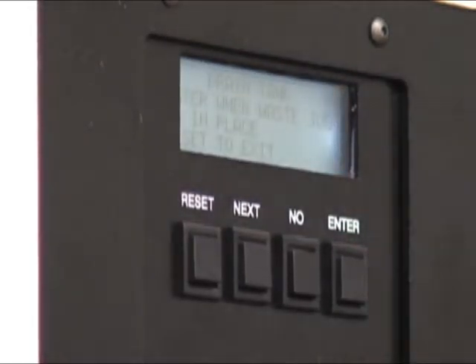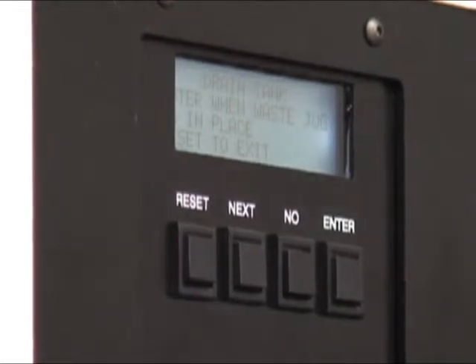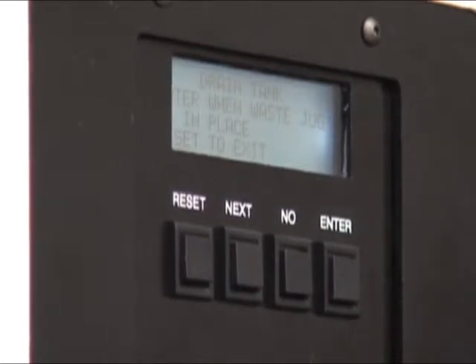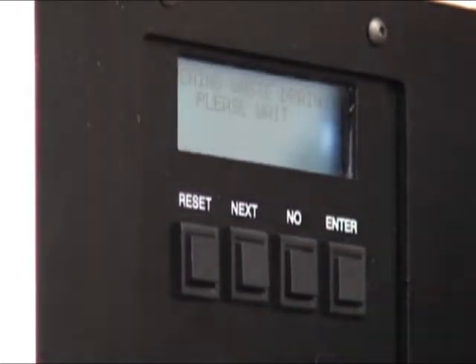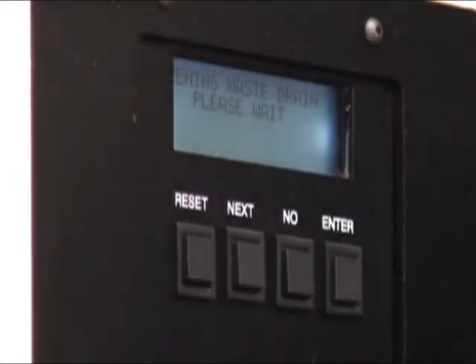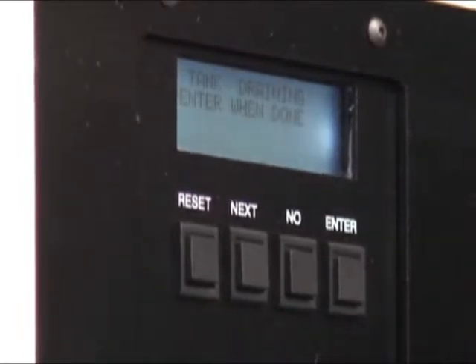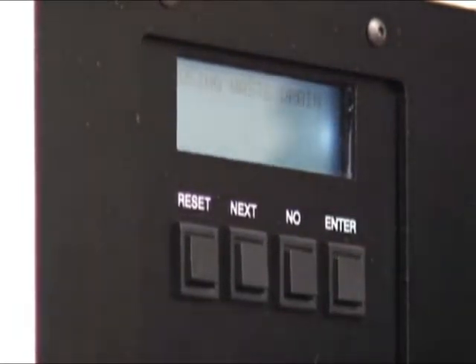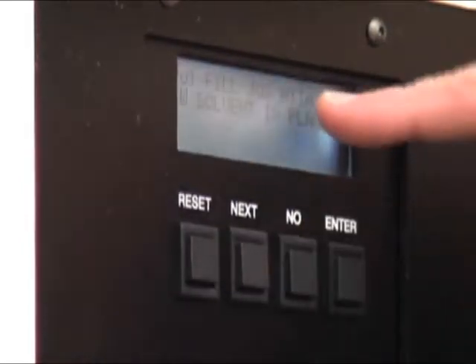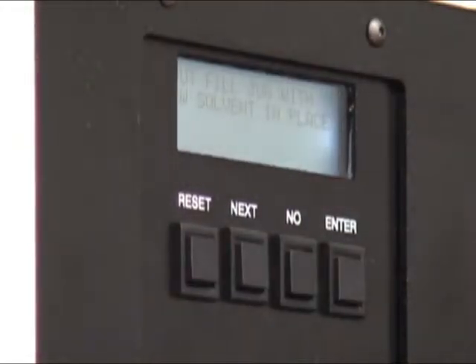Performing manual drain — enter when jug's in place. The jug you're talking about is the waste jug. And why are we doing this? To make sure there's no residual xylene from the previous run. So all you do is simply stand in front of this machine and press enter. That's the waste drain opening, and you just stand here and wait — it says please wait. As soon as the actuator switches and says enter when done, simply press enter. And it closes. Just those few moments are enough — if you get a drop or two, you'll be lucky. Then it says put the fill jug in place, the new container in place with a new solvent, which is going to be your alcohol.